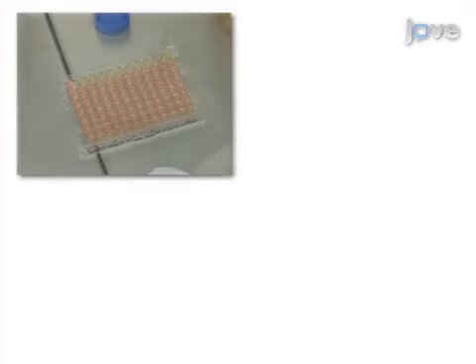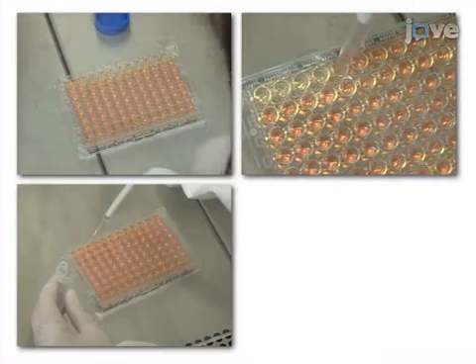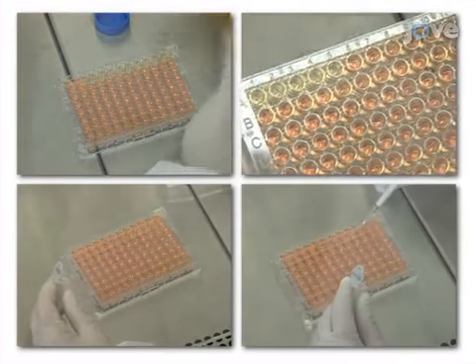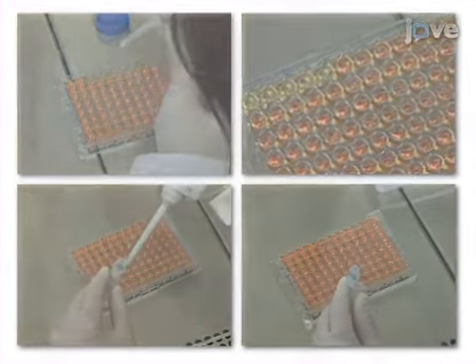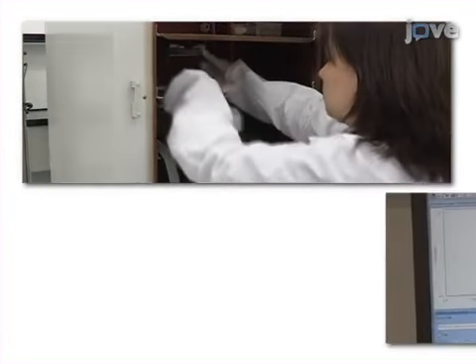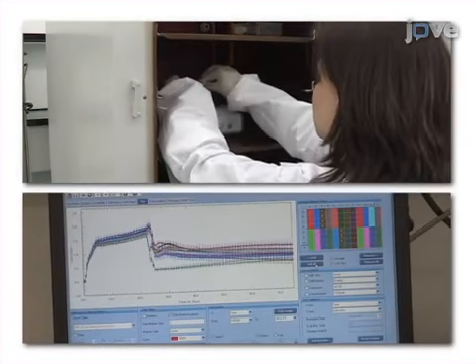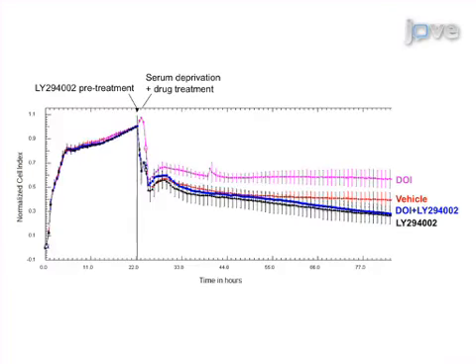In the second step, potentially relevant second messenger pathways are pharmacologically inhibited before subjecting the cell line to neuroprotective treatments. Next, the status of the neuronal cell line is followed using a real-time cell analyzer under the different experimental conditions. Ultimately, statistical analysis can be used to assess the real-time involvement of second messenger pathways in the cytoprotection of the neuronal cells.